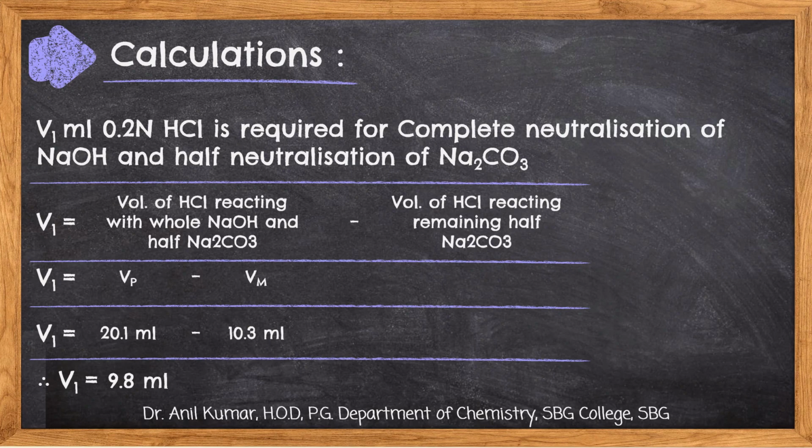Okay, you know this point? One to two drops. Write down the point. Now the point is, how much is it? 20.1. You write down, this is 20.1. The solution becomes colorless at the point 20.1.